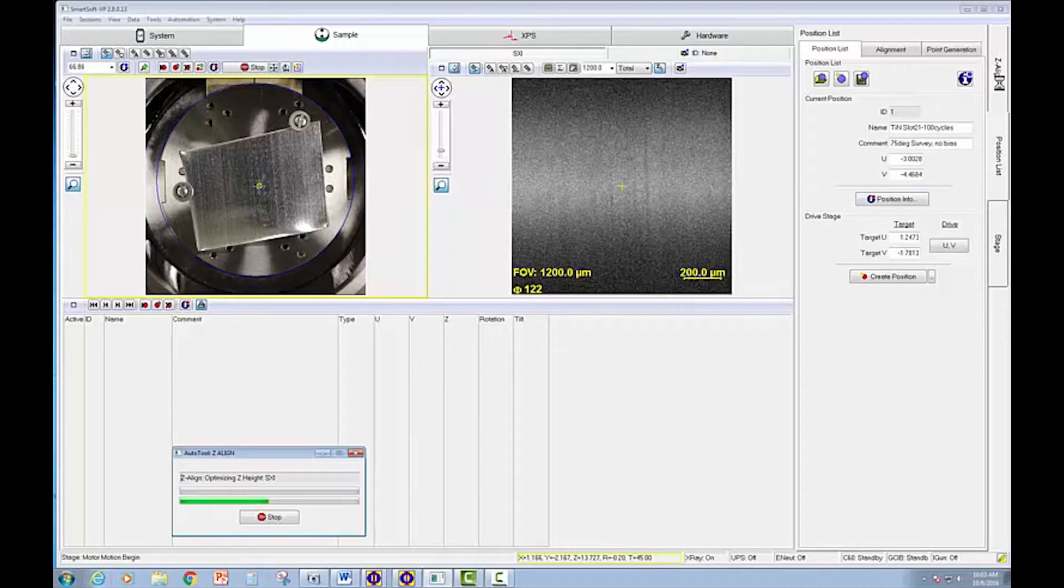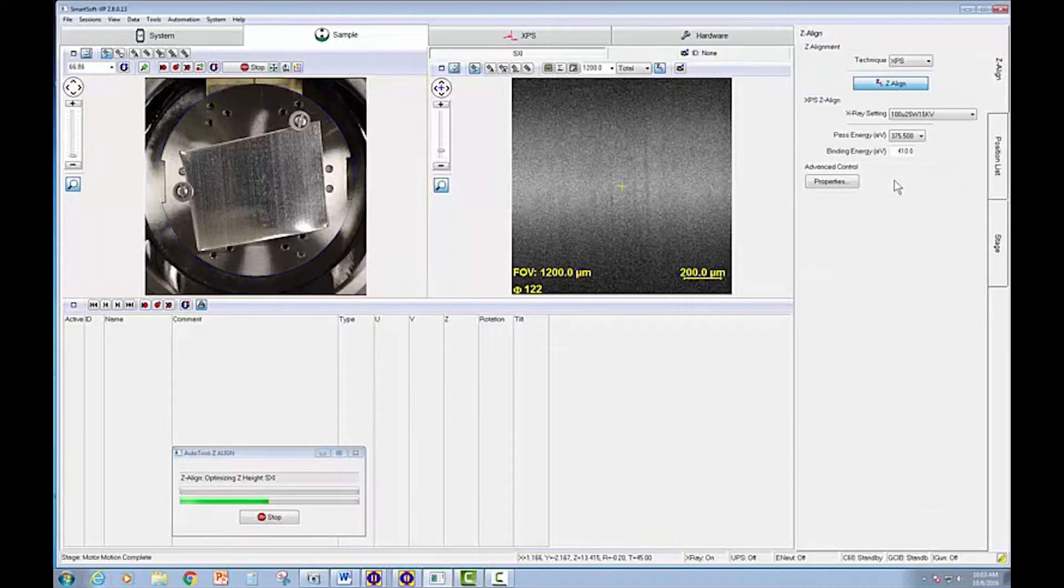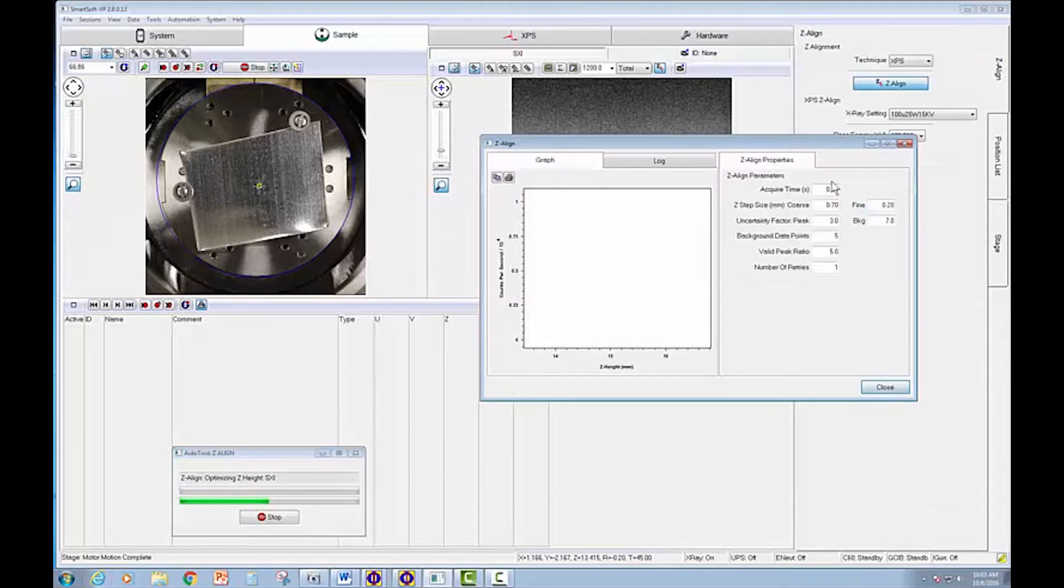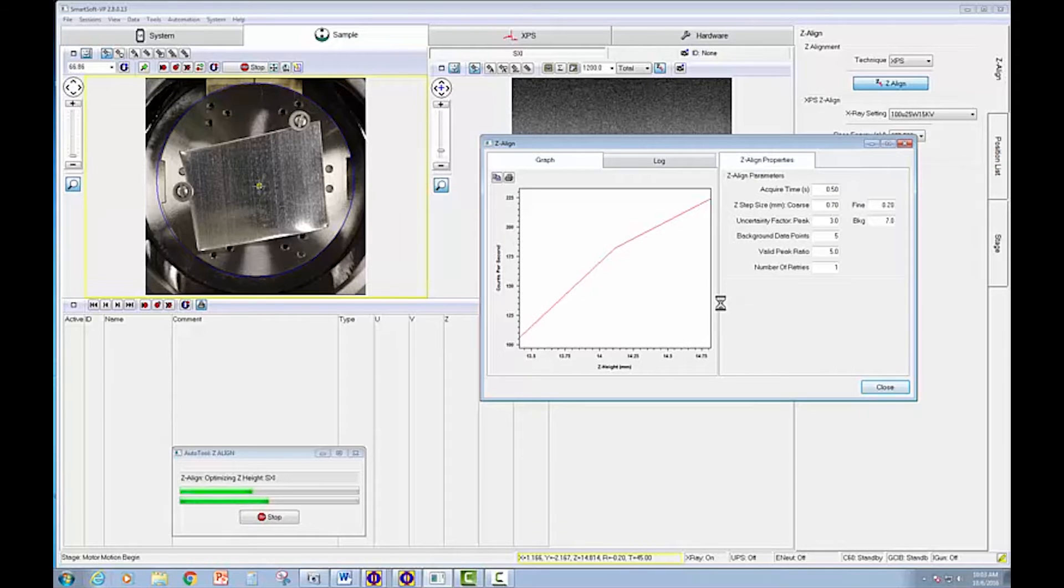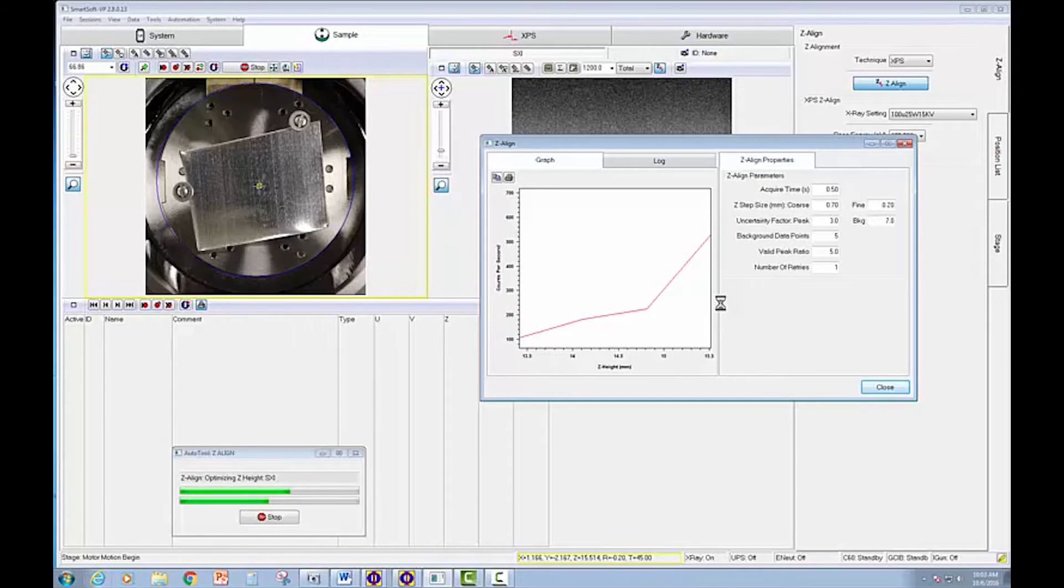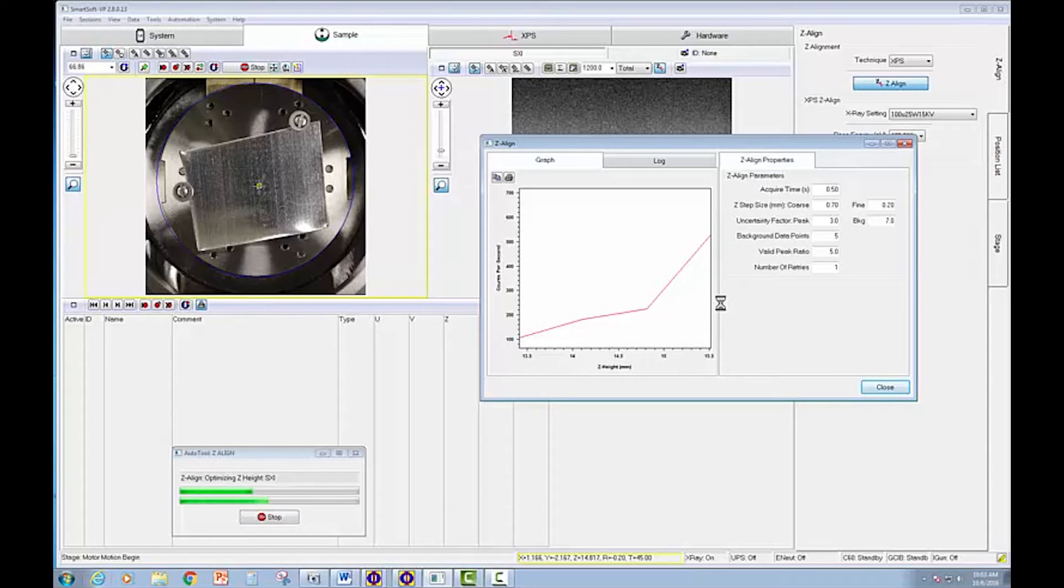We can also view the progress visually if we want to, and very shortly we'll see the maximum Z-height appear. We're already seeing signal rise as we approach the correct position.